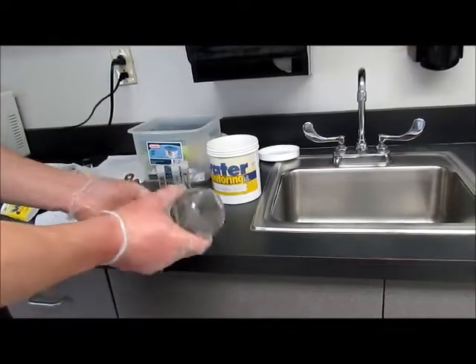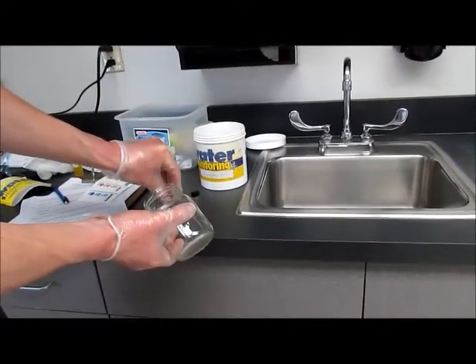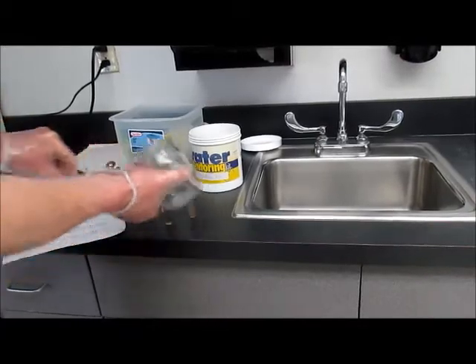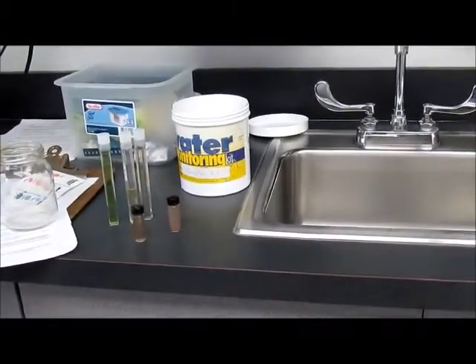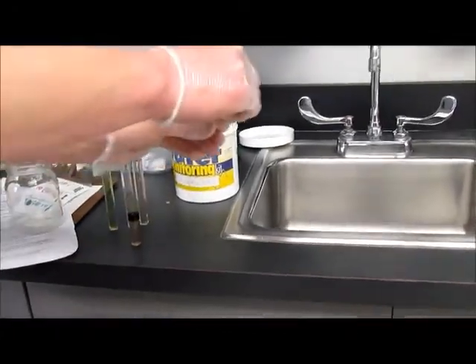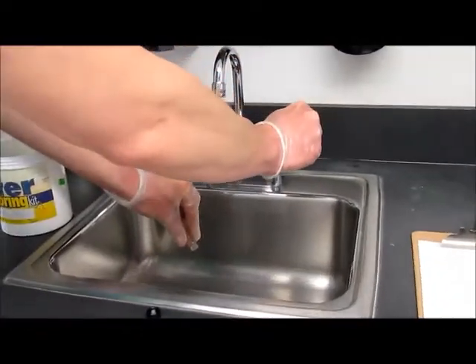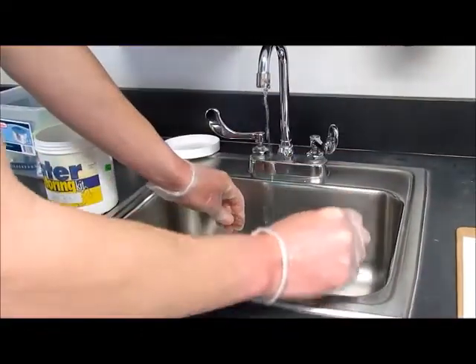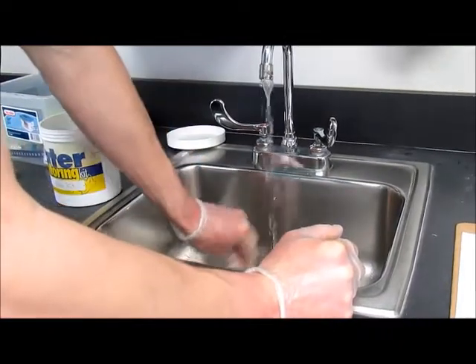Now we want to take all our sample vials that have the test tablet and water mixture inside back to the lab, where we will wash them out. We have the two oxygen test vials, and then the phosphate, nitrate, and pH vials. You want to wash them out under the sink.